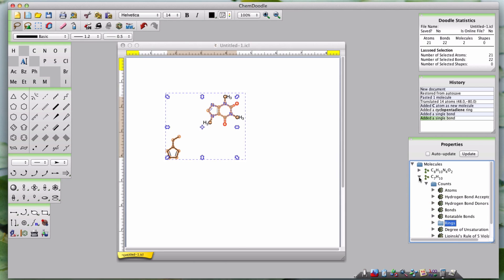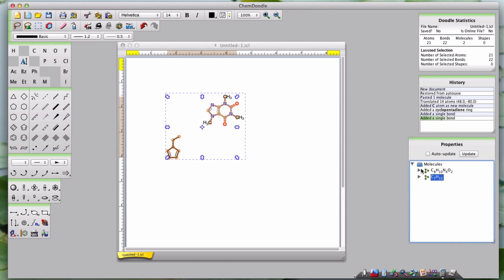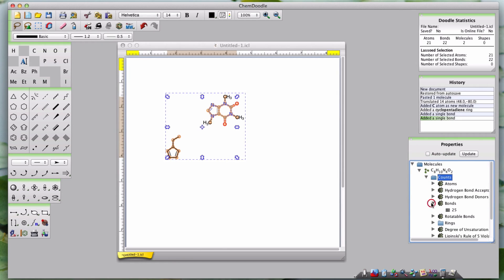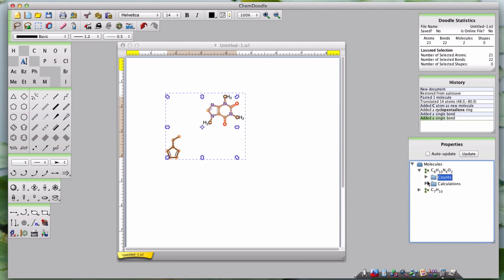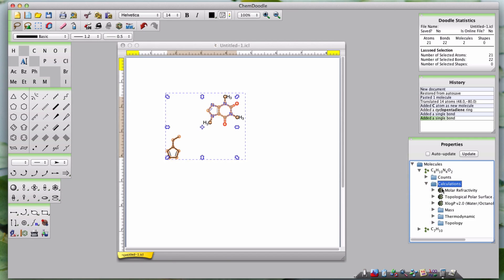There are two main types of properties that the Properties Widget calculates. The first is Counts, which includes things like bonds and degree of unsaturation. The other is Calculations, which include things like molar refractivity and mass.